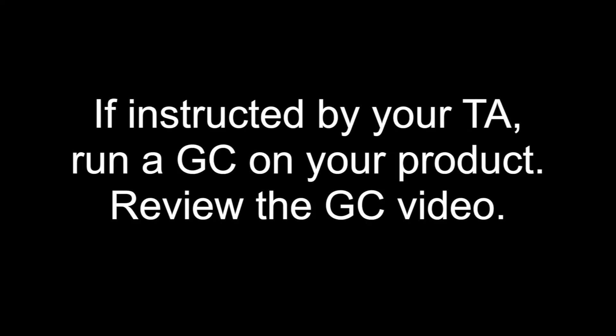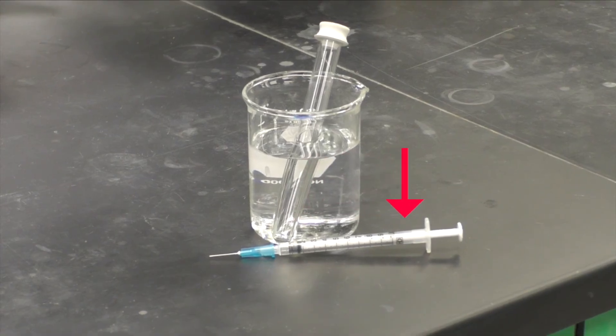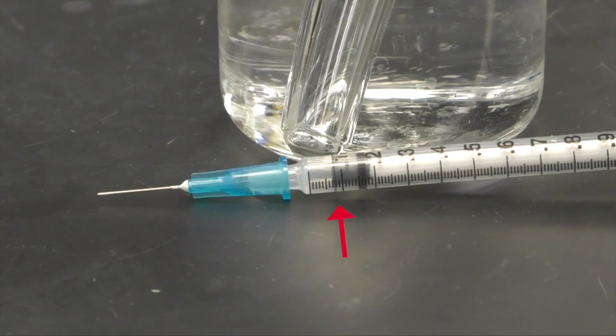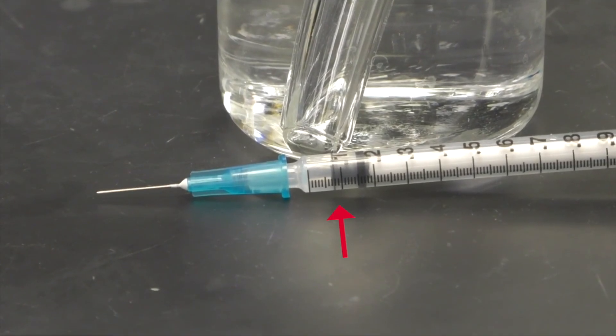If instructed by your TA, run a GC analysis on your product. Because it is a gas, you'll be using a different type of syringe than the one used for a liquid product. You'll insert the needle into the rubber septum and draw up 0.05 to 0.1 mils of gas for your injection.